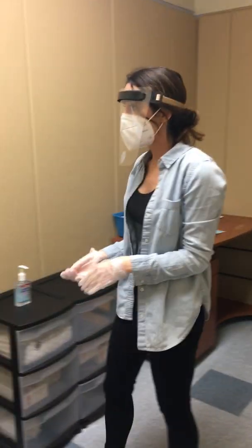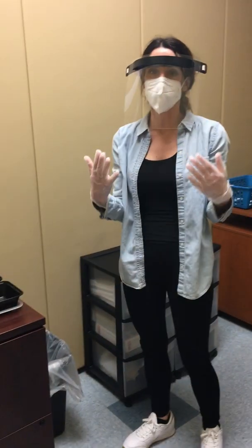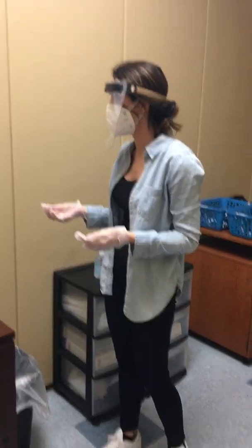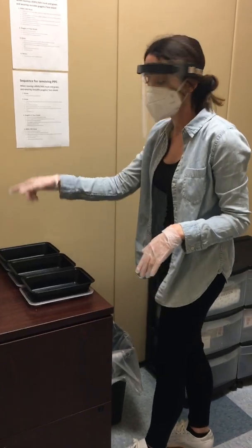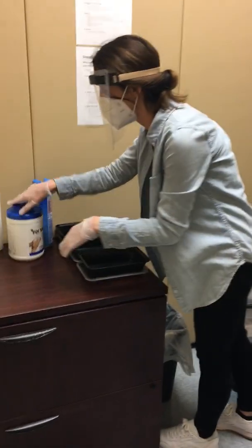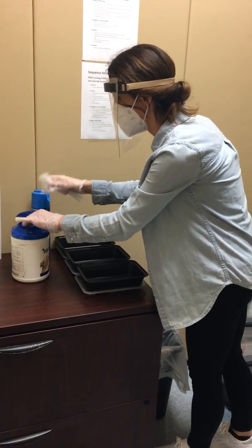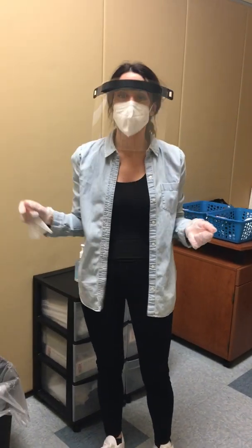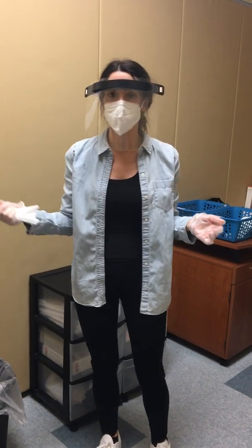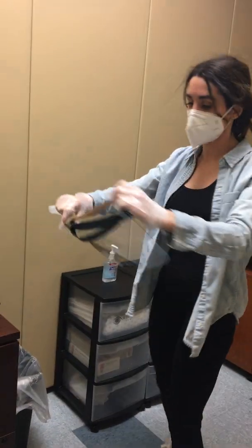And then from there I would actually leave these gloves on, because what I'm now going to do is take either a disinfectant wipe, or I could use disinfectant spray and a paper towel. In this case, I'm just going to use the wipe. I'm going to get this out, because now I'm going to remove my shield, and I'm going to do that just the way that we did when we were doing the original PPE sequence, from the back, just lifting right off my face.